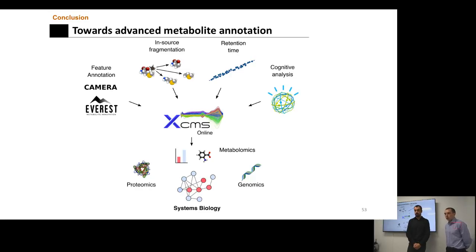That is going to be dependent upon whether you're looking at UPLC or HPLC. You'll notice that the points will exist further outside what the line is. The line is where it is pulled back to post the alignment. And so you're hoping that all of your lines are under the acceptable deviation that you have. So to speed things on, I'm going to now move any questions further to Xavier.